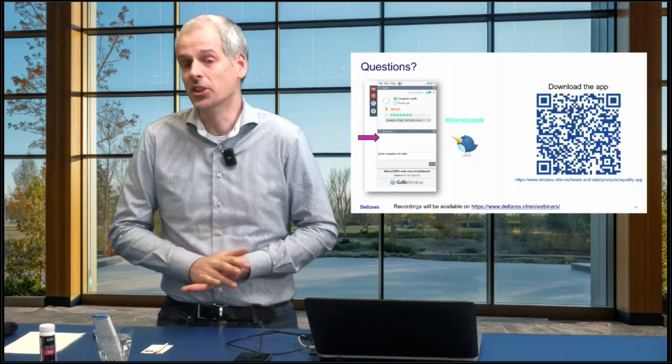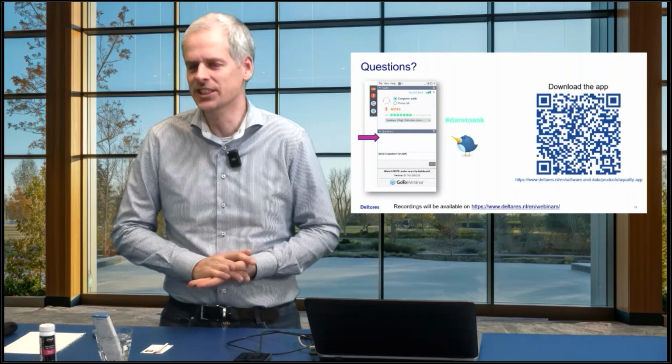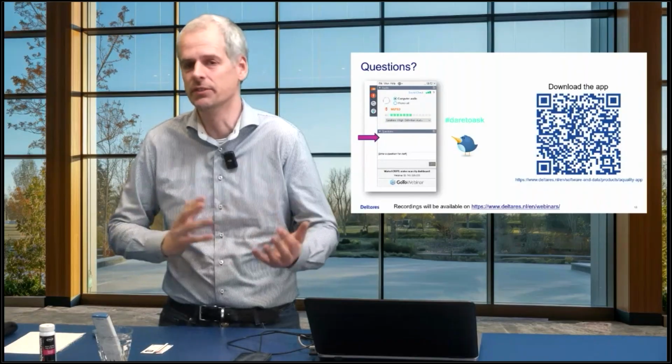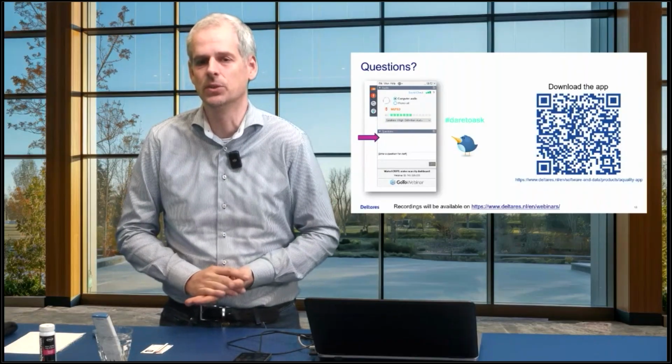Yeah, so the short answer is yes, we see some slight differences between phone types, especially, of course, for all the different types of Android phones.